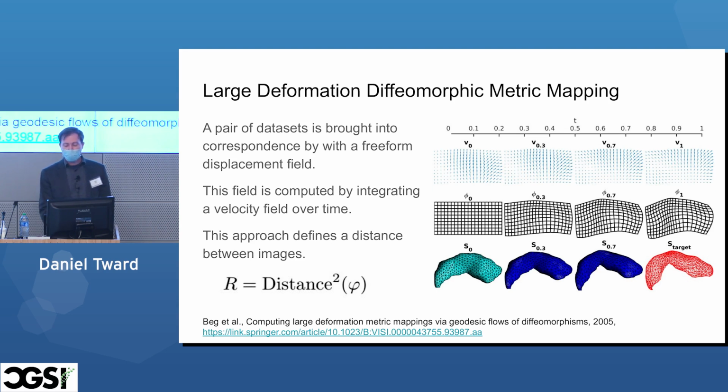We'll then construct a smooth velocity field as a function of time. You can see that in the second row. And then we integrate this velocity field over time to get a smooth displacement field, which I show in the third row. So as you know, the integral of velocity over time gives displacement, and we're just doing this at many points in space altogether.